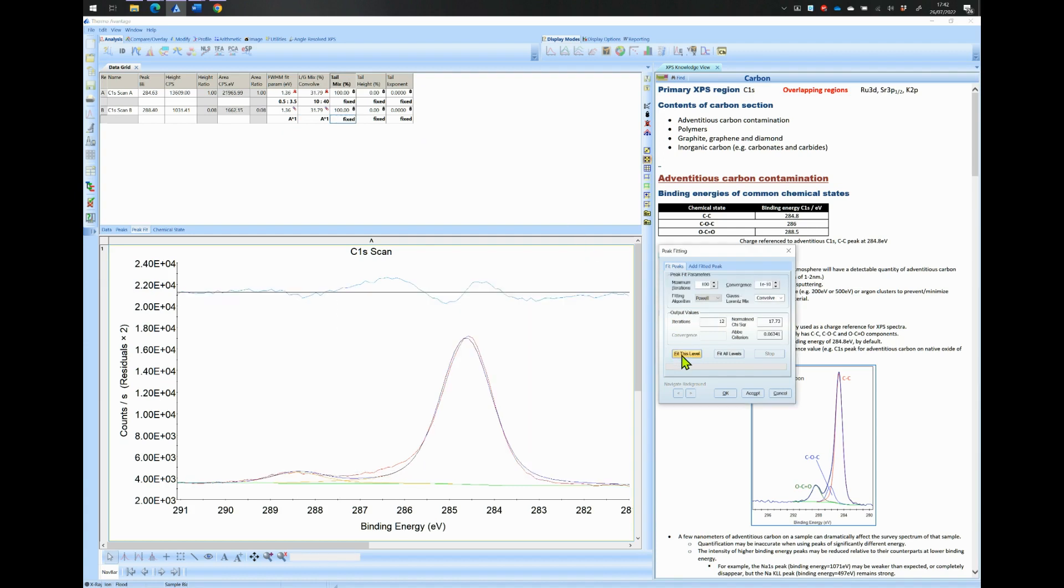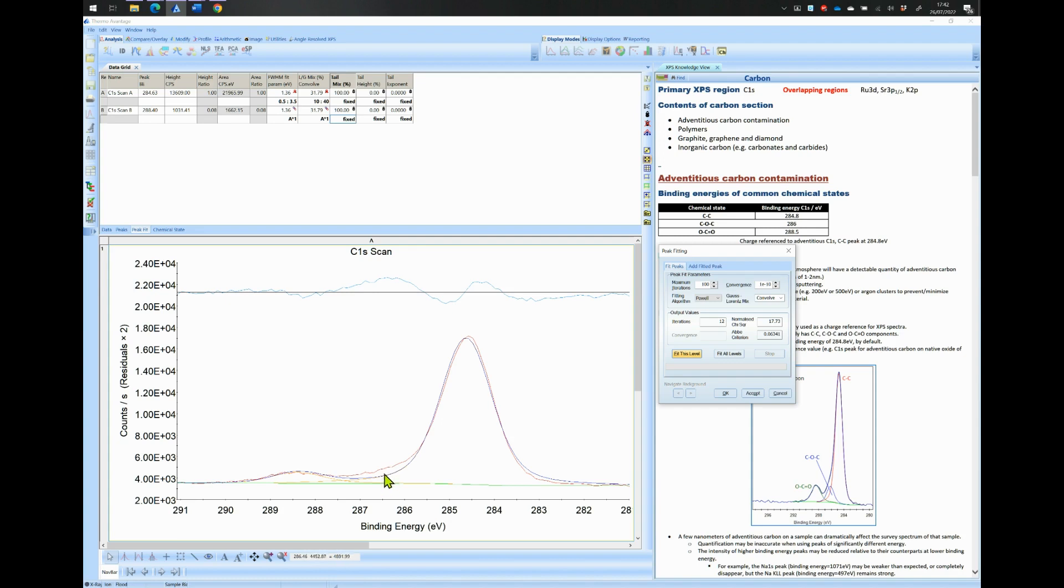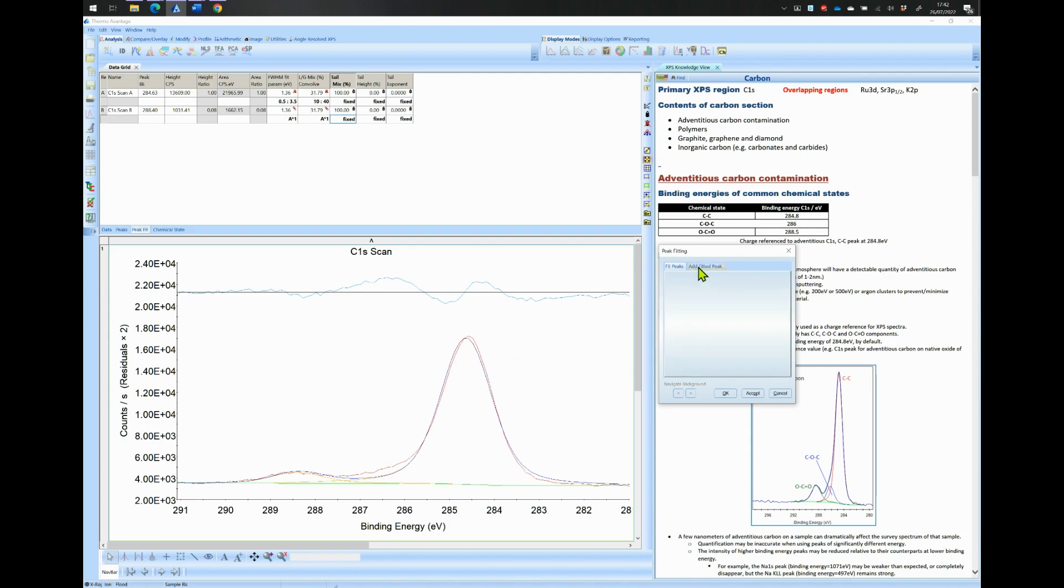Check the width and LG ratio values. The width here is a bit high above 1.3 eV and the LG ratio is above 30%. Also the model does not fit well with the data at binding energy around 286.5 eV. This is an indication that there must be another peak around the 286 eV region.